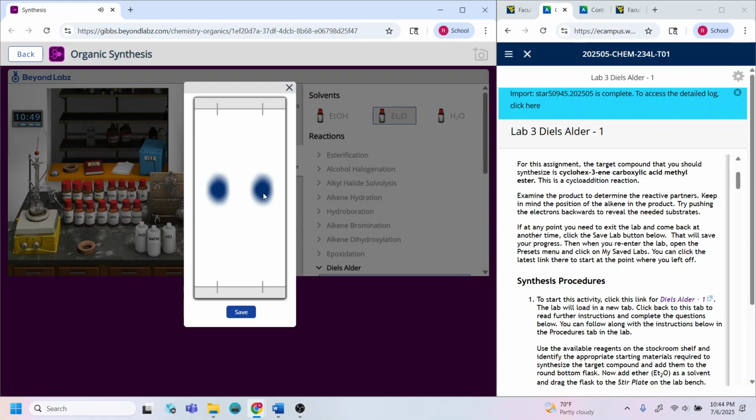Okay. So go ahead and get the RF value for the TLC. And again, the RF value has a maximum value of 1. It cannot be greater than 1. And 1 means that it is all the way to the solvent front. So pay attention over here. This is going to be your RF value. You're going to measure from the midpoint of the center to the spotting line. This is going to be your distance here, and you're going to divide it by the full distance up there. Okay, your value should be less than 1. This is going to be your starting RF value.